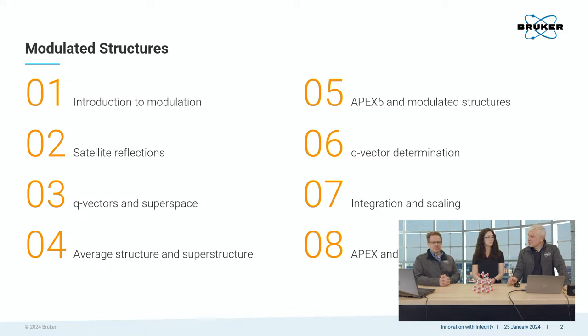I will just touch on those and show what's different. And then we'll also show how you can prepare files to use JANA 2020. This is the program you will need to properly describe the structure in a higher dimension. We won't really go into this. There won't be enough time to do this, maybe at a later time. That's right. We can always do another episode.